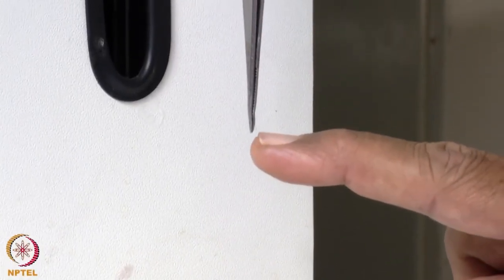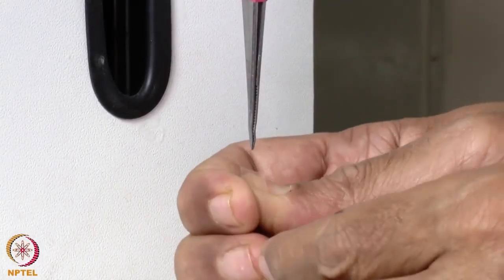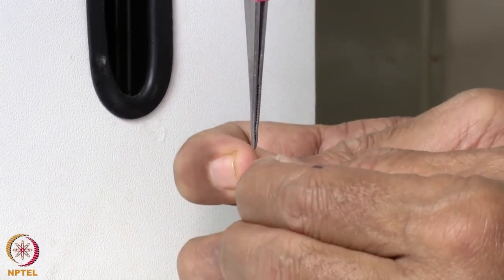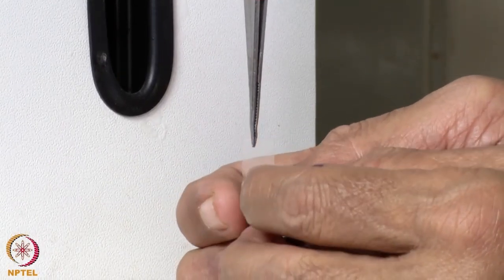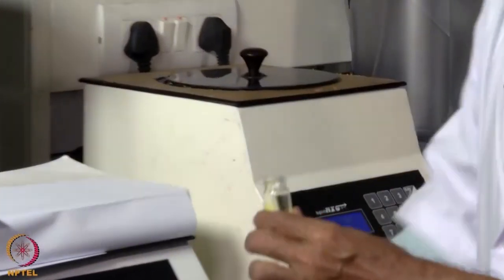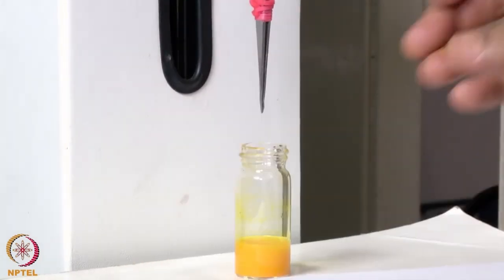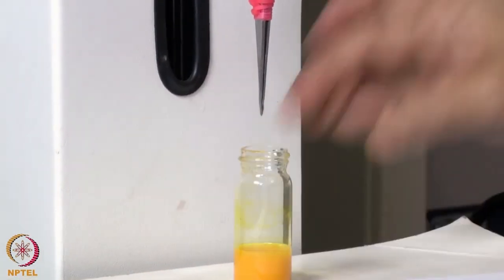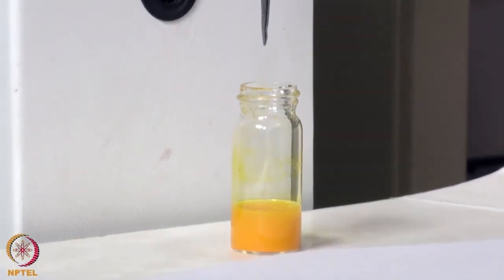You need to place the film at the tip — this is the polyester film. The curcumin solution is placed below, and we start the run.